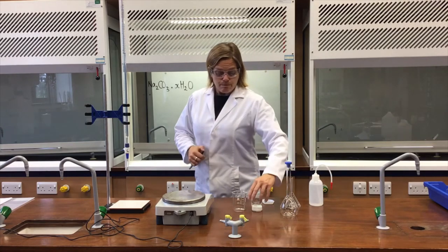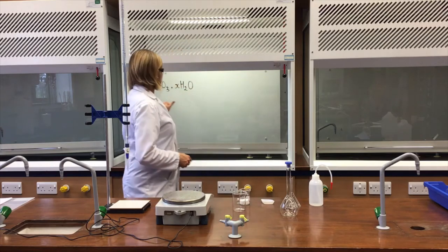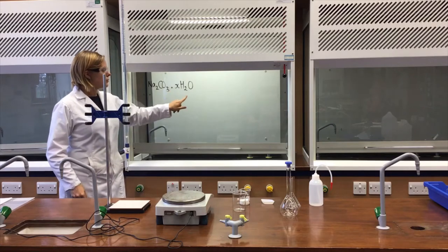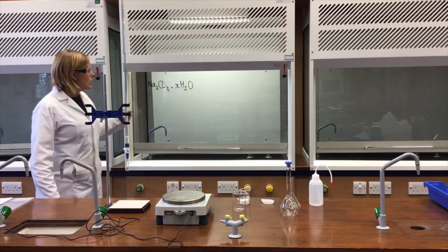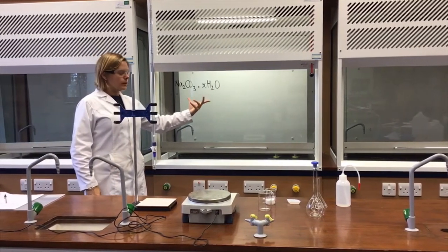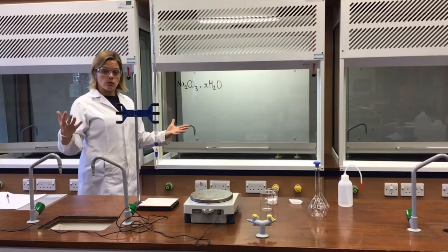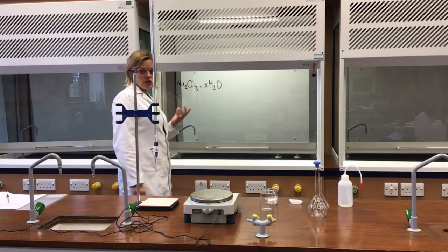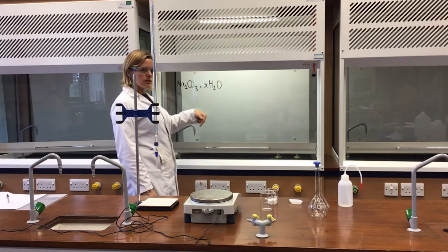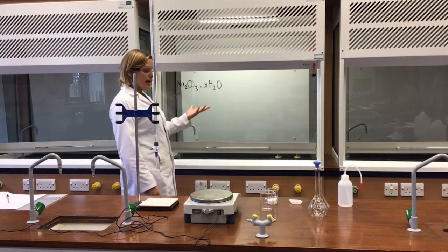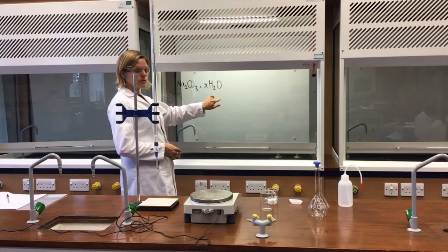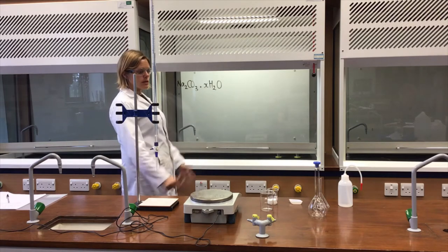What I've got in this beaker is washing soda. Washing soda is Na2CO3·XH2O — it contains sodium carbonate and a number of moles of water of crystallisation. Washing soda is interesting because it loses water of crystallisation over time; very fresh samples have a particular number of waters, but over time they lose those to the atmosphere. The aim of this experiment is to work out X — how many waters of crystallisation remain in this sample.